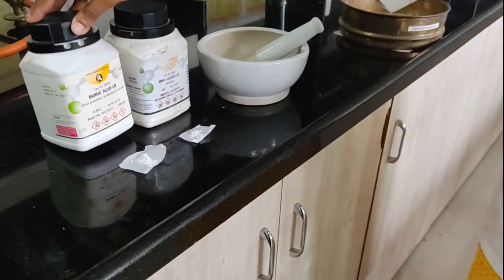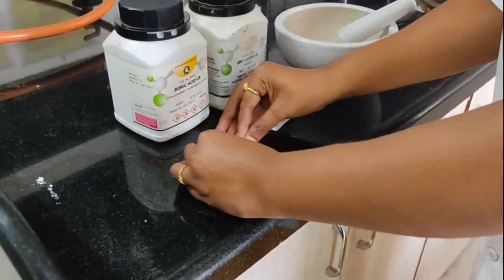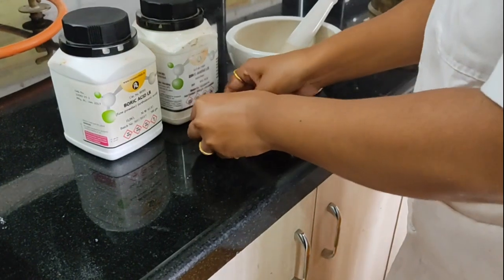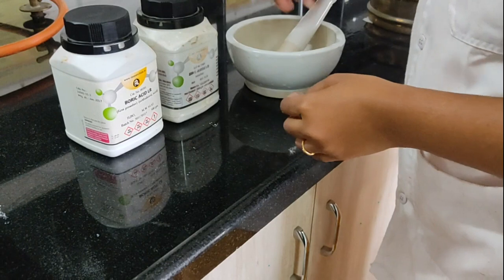So we have this boric acid and this zinc oxide, which are previously weighed. Now I am going to transfer this boric acid into this mortar, and then add this zinc oxide into this mortar, and proceed for proper trituration of it.